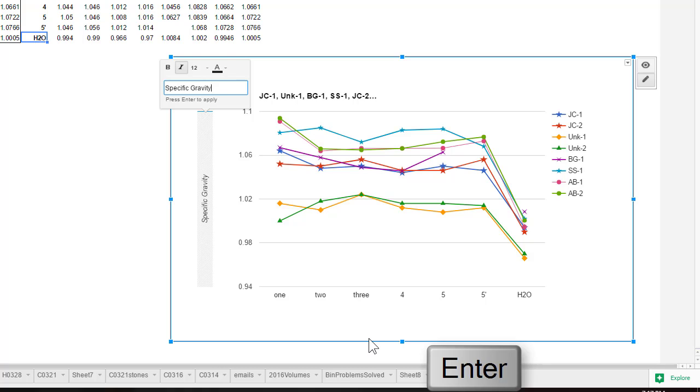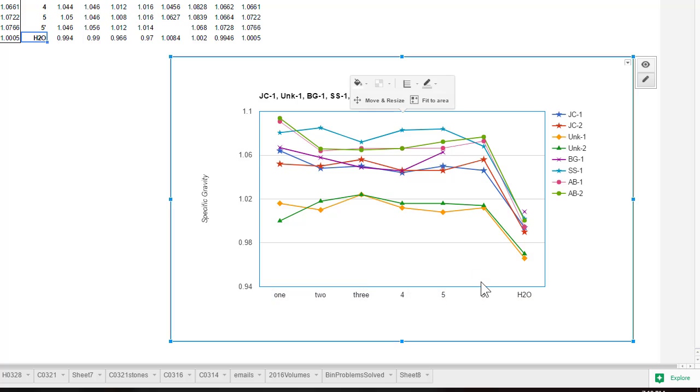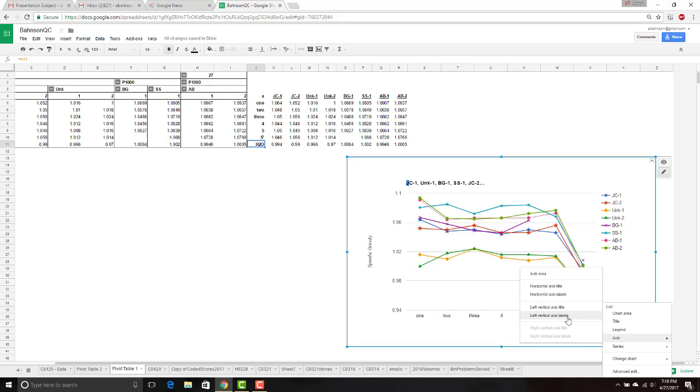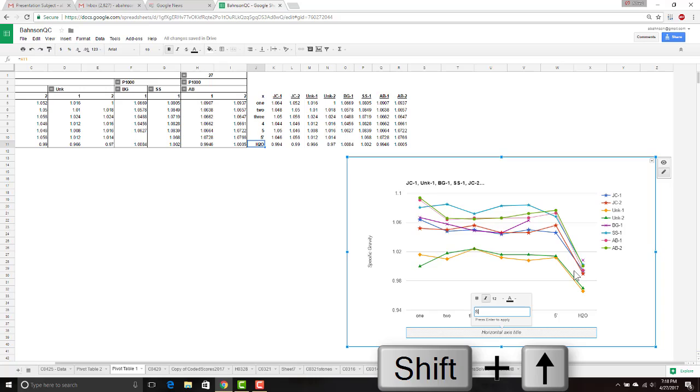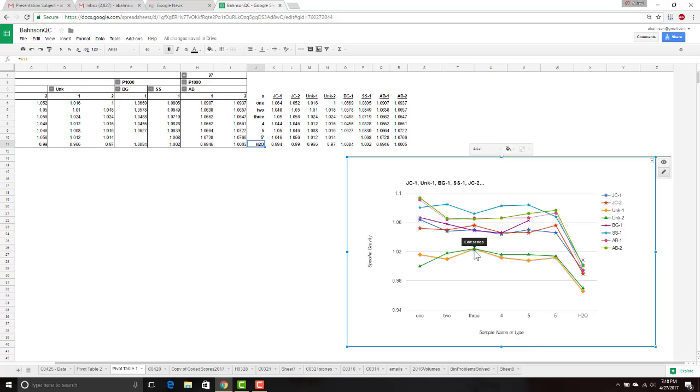And down here, the important thing to point out now, this is just sample, let's call it name, okay, sample name or type or whatever you want here. But the important thing is there's no relationship between the first and the second. There's nothing occurring over time, and that's not entirely accurate. But water is simply water, and sample 5 is simply one of these samples with yeast added to it.